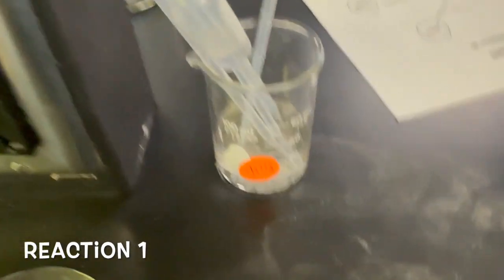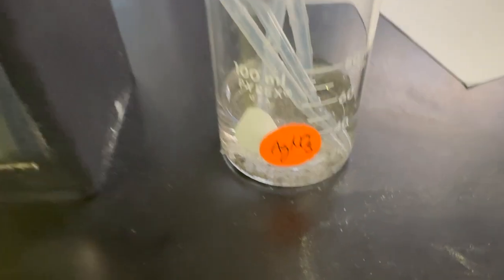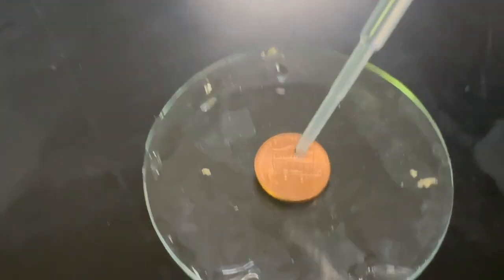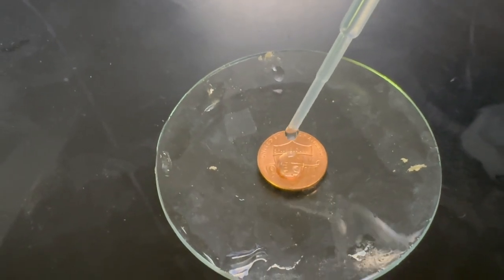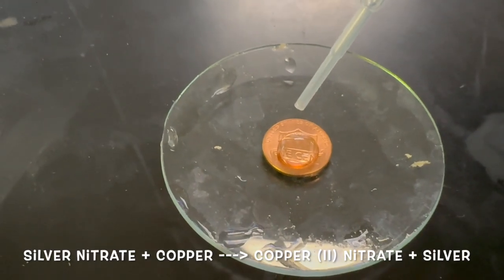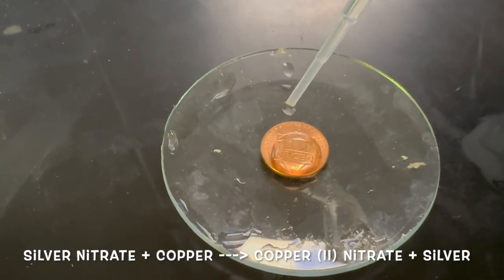So our first reaction is going to be silver nitrate reacting with copper. Now, obviously, we're not going to react the entire penny. Even if we did, it's mostly zinc, but it is copper plated, so the copper will react with the silver nitrate in a single replacement reaction.